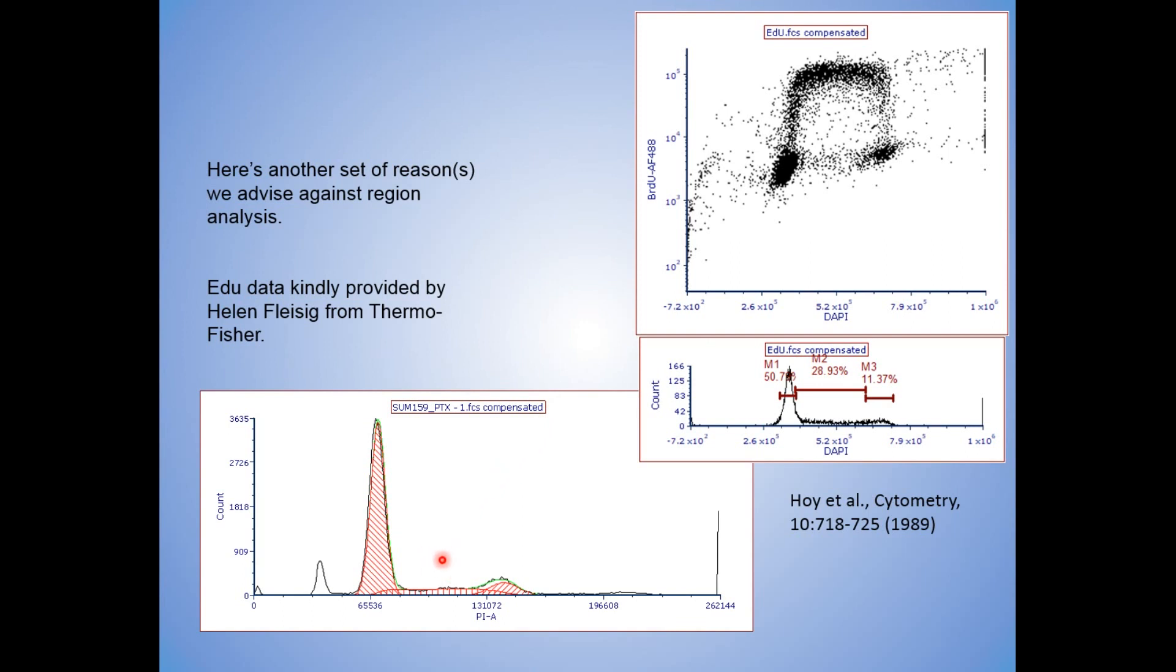Let the cell cycle modeling software do it. In fact, the one file here, again, that's SUM 159. You see the spill in here? Follow the red dot. That spill in here. This is S. There are guys here in S that are still going to be counted in G1, G0. That's these guys.